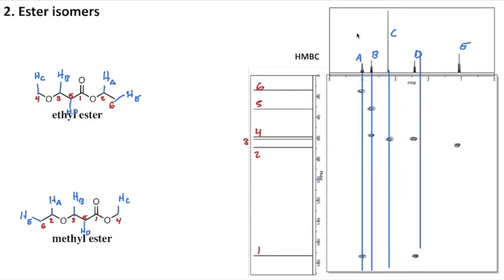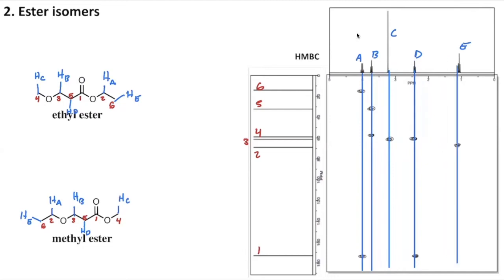And this may be a little bit of an eyesore for some who feel visually overwhelmed by the NMR data itself, or just by the fact that there's going to be a lot of lines here. So bear with me if this is not a method that feels comfortable for you to use. Definitely go ahead and use a method that makes more sense or feels easier for your brain to wrap around. Like I say, there are many, many correct ways to approach these types of problems.